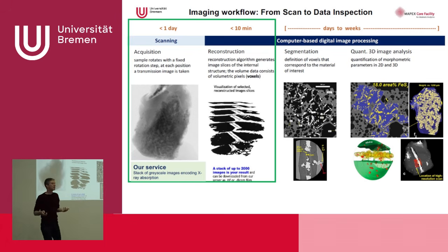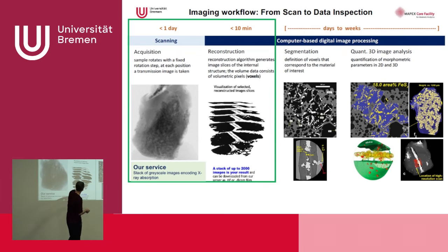It can be between 4 gigabyte and 16 gigabyte or something like that. This is what you will get when you are a customer. You give your sample, we measure it, I reconstruct the density, and then later what you get is this stack of images which then you can process at home. Or, of course, we make a cooperation, and I can give you a short guidance or support you in using the correct software. Because once we have that stack of images, now the interesting thing starts, just after it is reconstructed.